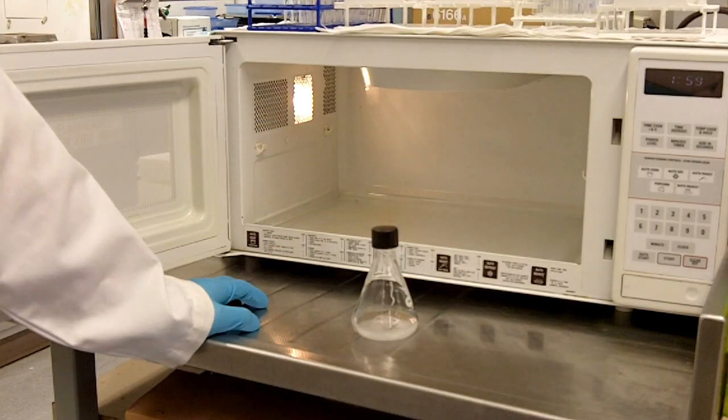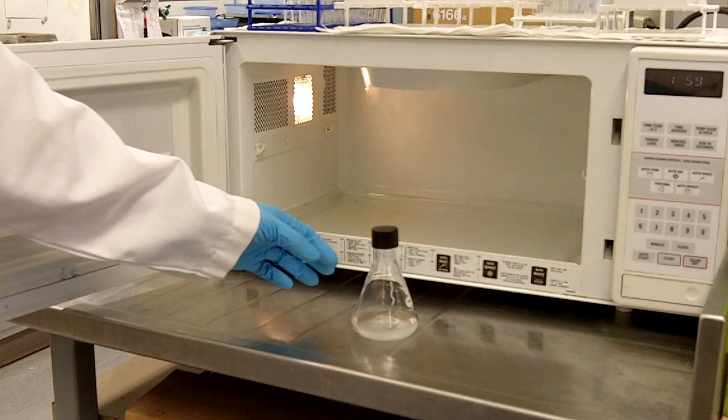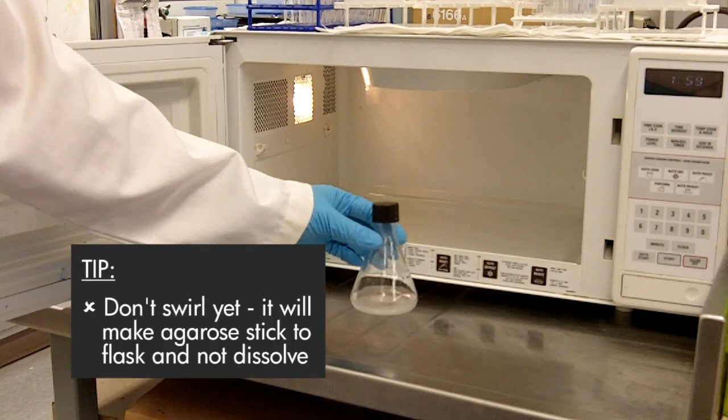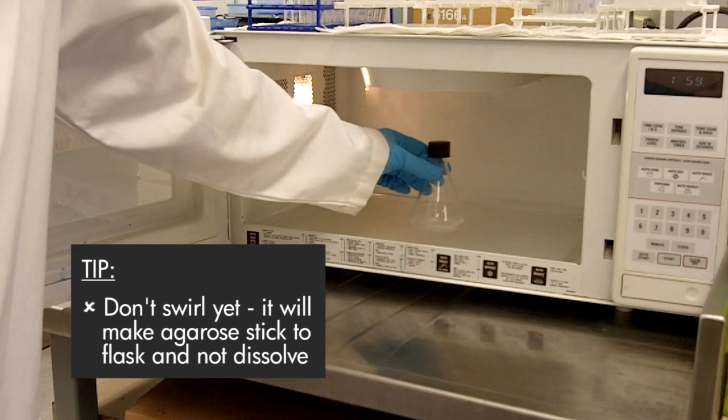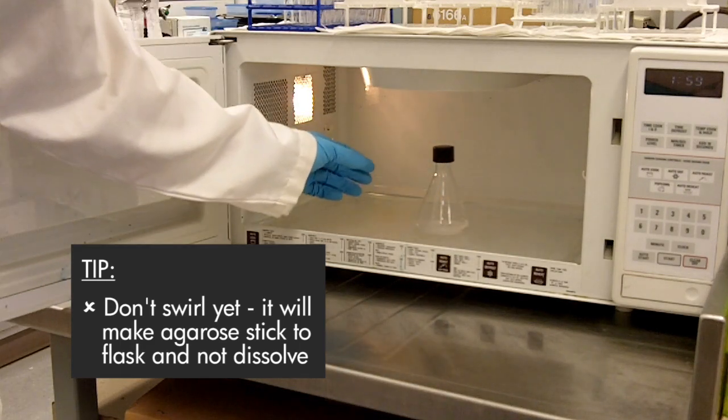To dissolve the agarose we'll just use a microwave. One important thing to do is that you do not swirl your mixture before you heat it up because the undissolved agarose is just going to get onto the wall of the flask and will not dissolve.